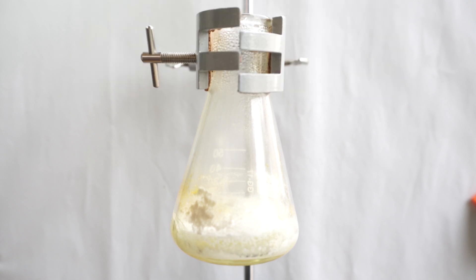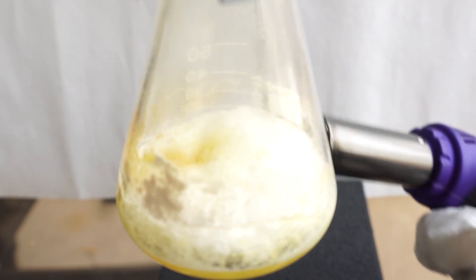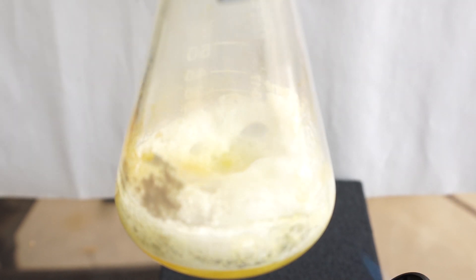We know the cadaverine has started to form because the powder will change from white to an oily yellow color. During this time, it will seem like the powder is almost breathing, as we can see the CO2 being liberated from the lysine to form cadaverine.